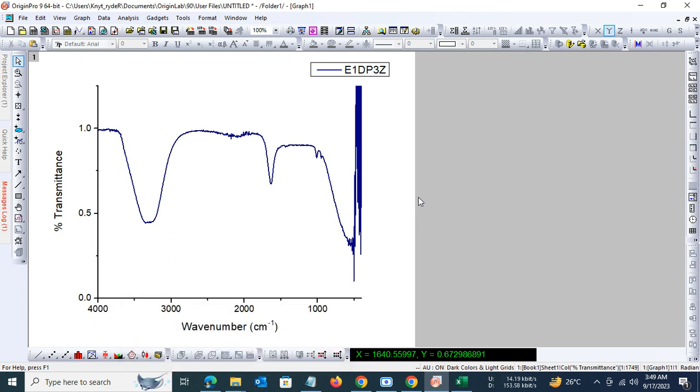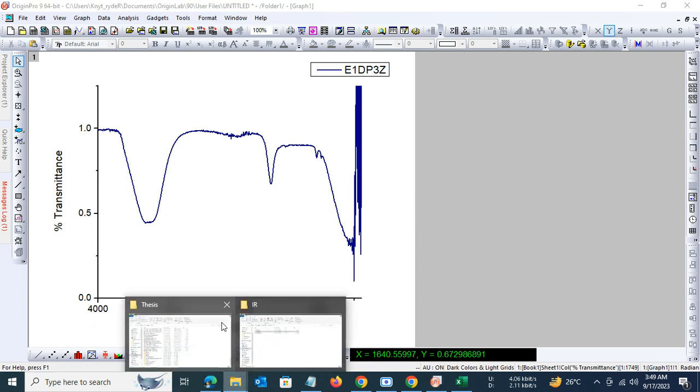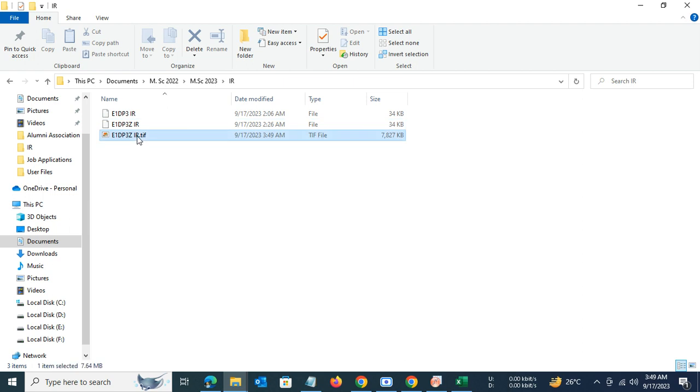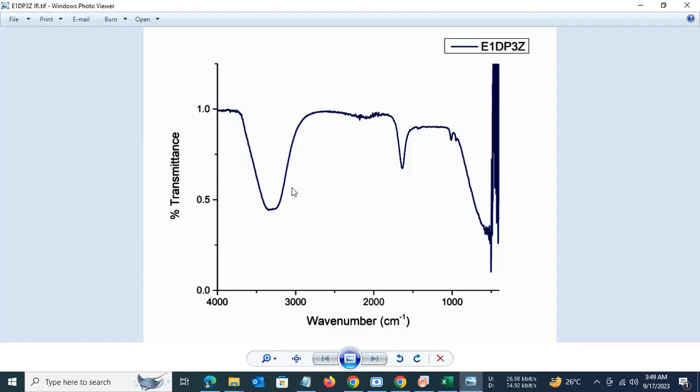That is how we develop an IR spectrum. So here is our IR spectral file.